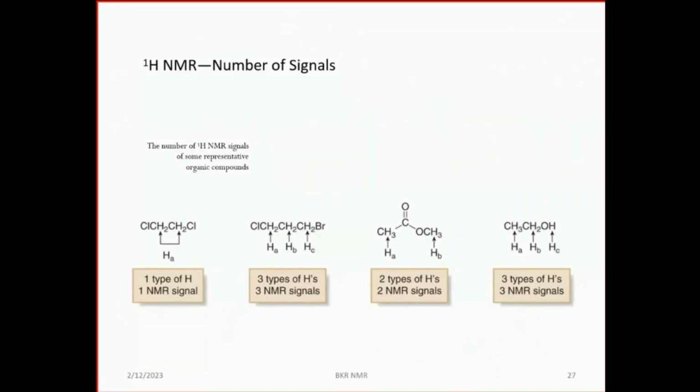So you can see here, cut the molecule: one carbon signal, one hydrogen signal. So one proton signal, one carbon signal. I can cut the molecule. In the second molecule, can I cut this molecule? Can I cut it like this? No, ma'am. Why no?